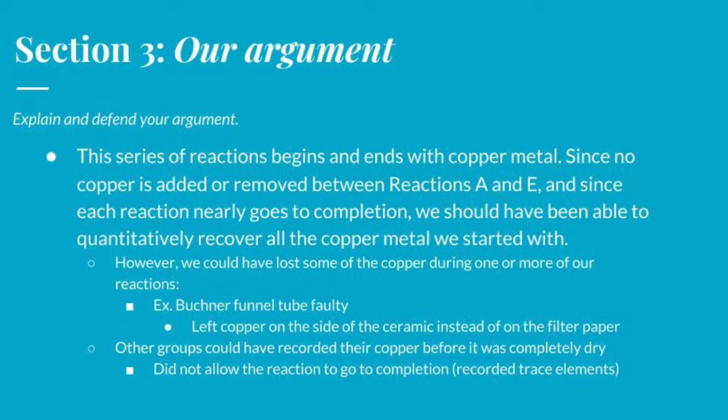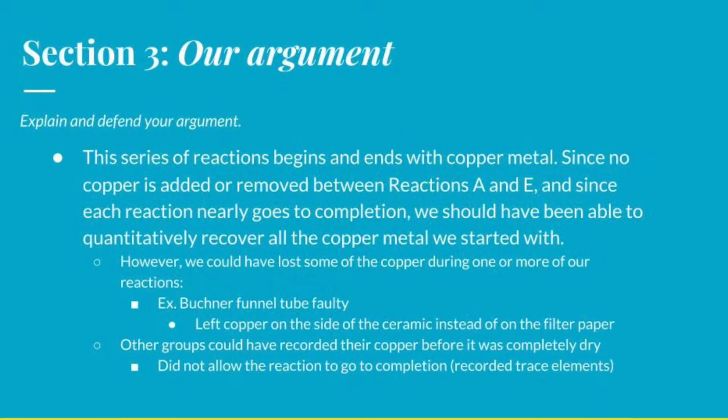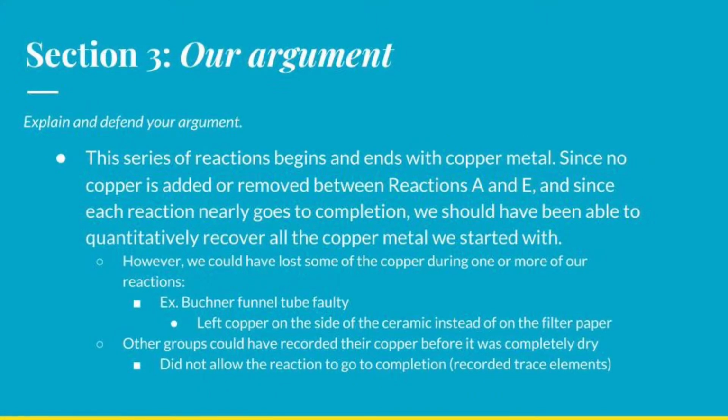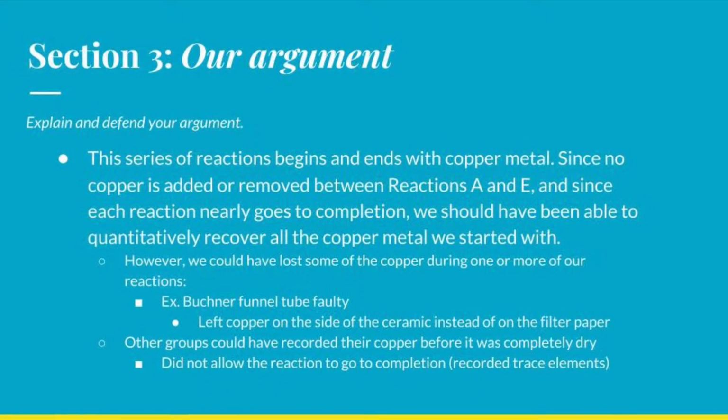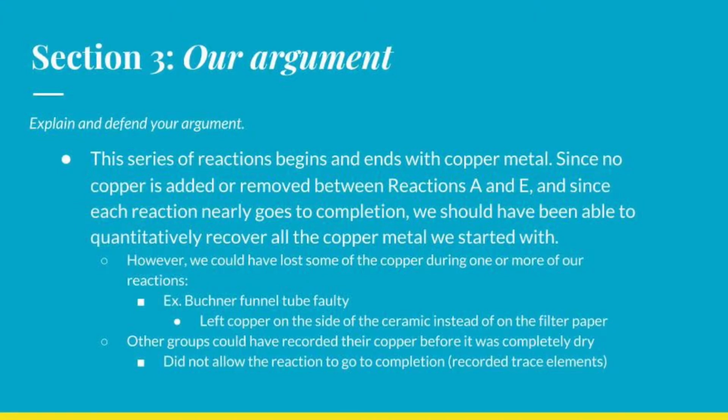Likewise, other groups could have also made similar errors. They could have recorded their copper before it was completely dry, thus adding some weight of the water, or not allowed the reaction to go to completion. For example, they added too much H2SO4.